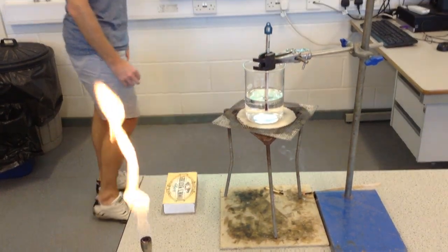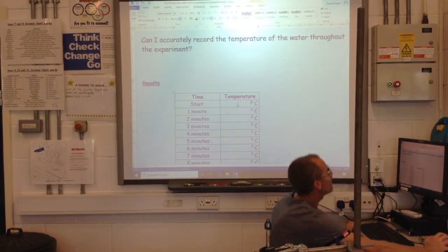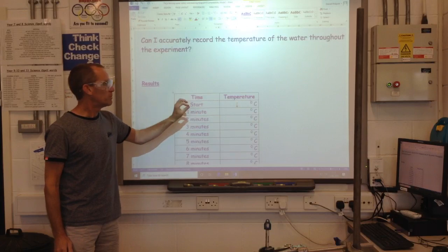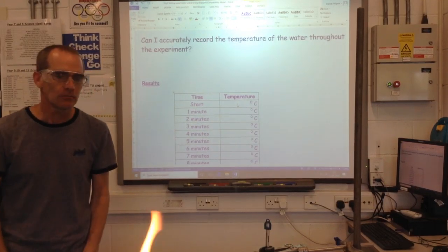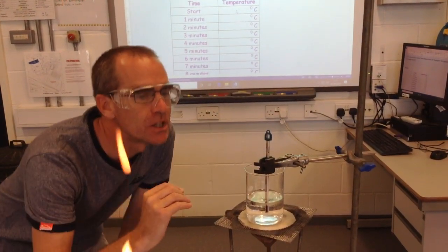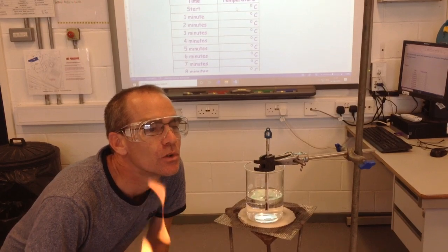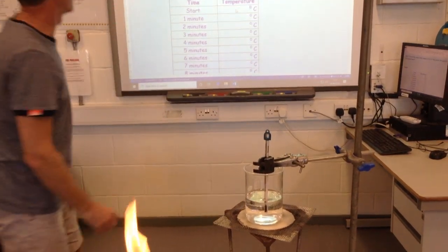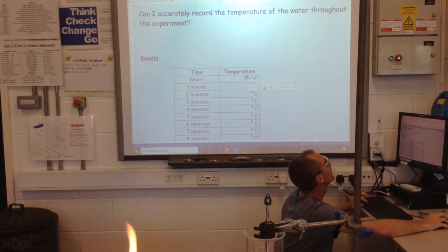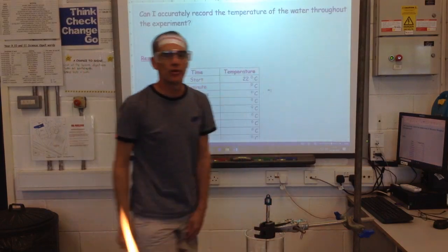Now, turning to my results table. The first temperature that I must remember to record is the temperature at the start of the experiment, before I actually begin heating. I need to know what temperature this water is — it's come straight from the tap. I'm going to try and get my eyes level with the thermometer, and that water is 22 degrees Celsius. So I can put that in here: 22 degrees Celsius.